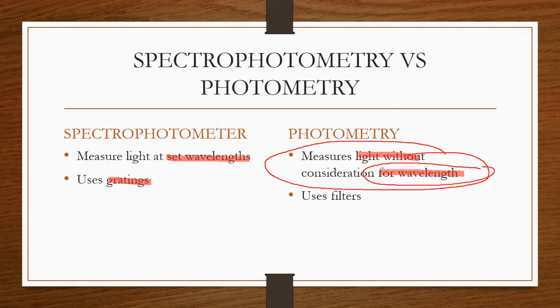By the way, if you're not yet familiar, let's try to review the concept of wavelength. When you say wavelength, it's a value at which the waves of certain light or certain light particles or waves can be measured. For a simpler explanation, when you say wavelength for our purpose, we're actually referring to the color of light.